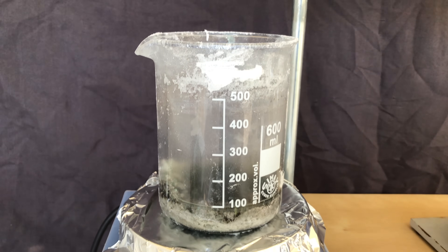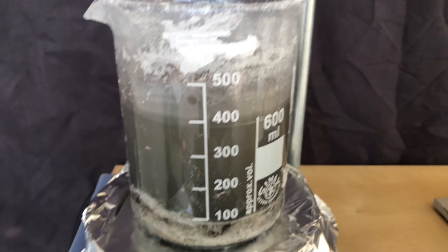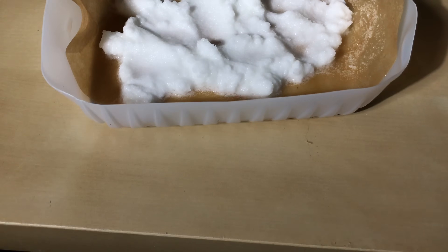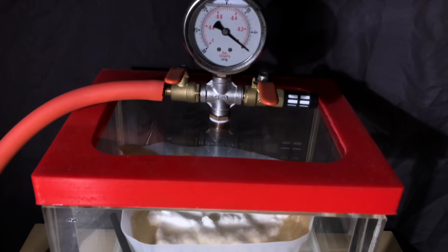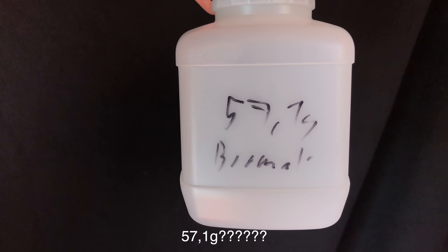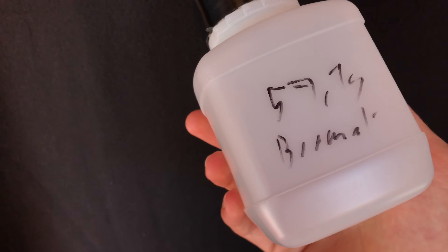Once the electrolysis was finished we were left with this mess. I added a lot of distilled water and heated it up to dissolve the bromate. A gravity filtration was performed while the solution was still hot, which got rid of all of the contaminants. The leftover solution before the recrystallization was discarded, so the bromate should be fairly pure. Another gravity filtration was performed and the bromate was dried in a vacuum desiccator. 57.1 grams of potassium bromate is unacceptable — we need to make more.